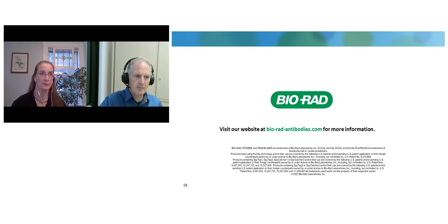So we don't need these cysteines for its function to ligate to the SpyTag. We introduced these cysteines for site-specific conjugation. So all our SpyCatchers carry the cysteine at the same position, are labeled through the cysteine, so have the label always sitting at the same position, and we know what is the degree of labeling of the catcher.